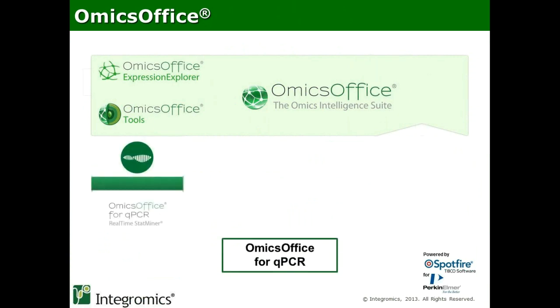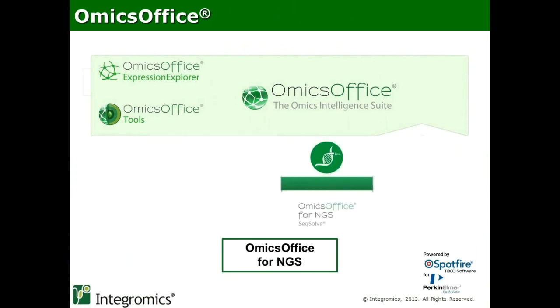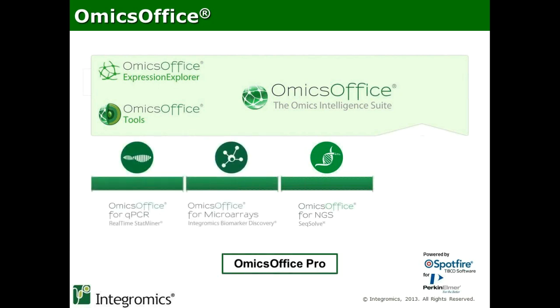In addition to this, if you don't have a different solution, we ourselves provide some automated workflows for the analysis of different types of data, such as qPCR, microarrays, and NGS, in this case, RNA-seq or ChIP-seq. So altogether, we would provide this package, which would be the OmicsOffice Pro.